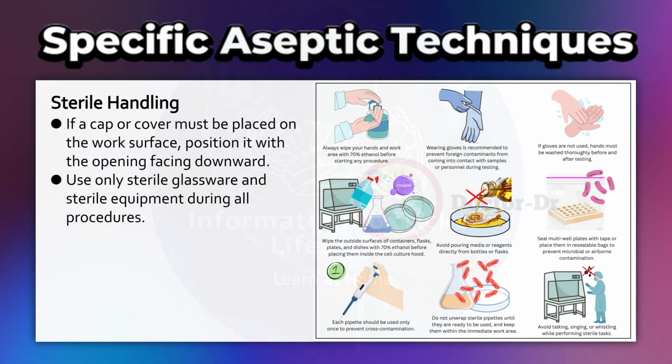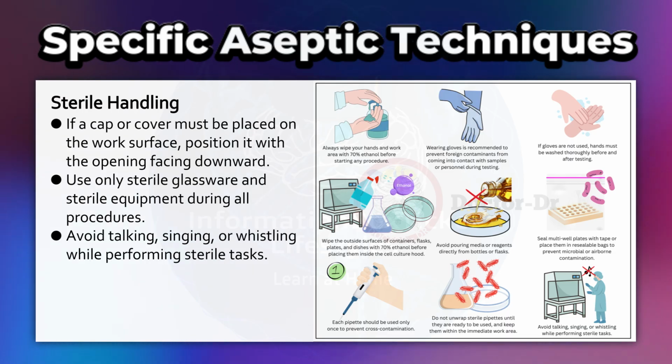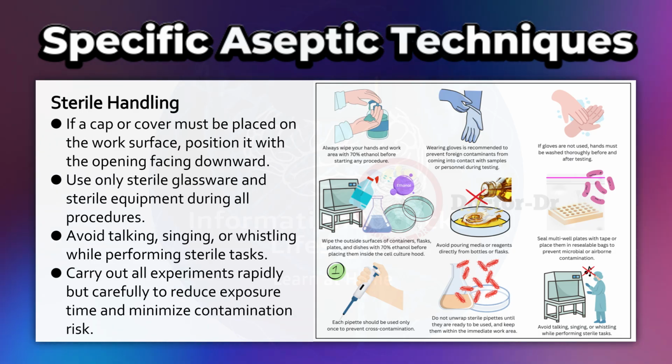Use only sterile glassware and sterile equipment during all procedures. Avoid talking, singing, or whistling while performing sterile tasks. Carry out all experiments rapidly but carefully to reduce exposure time and minimize contamination risk.